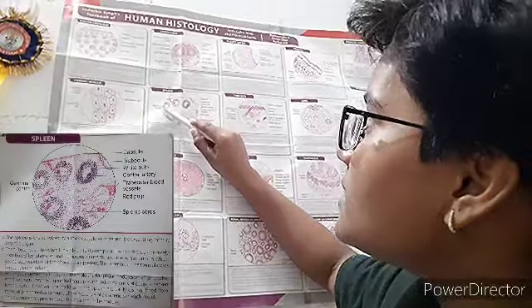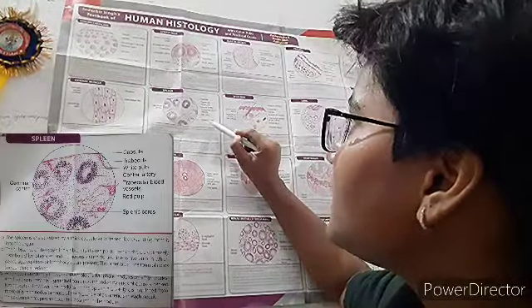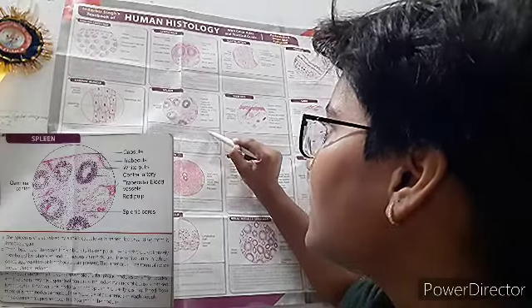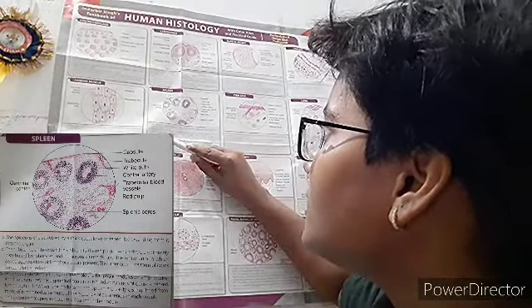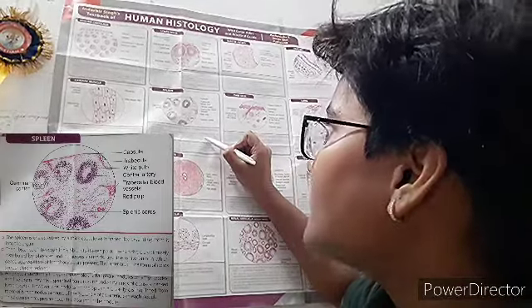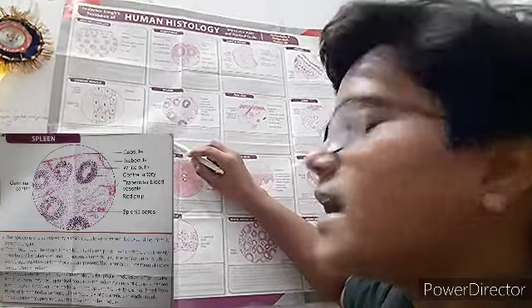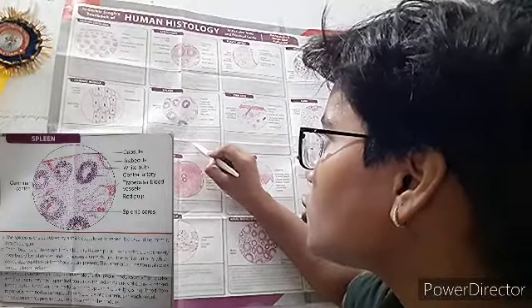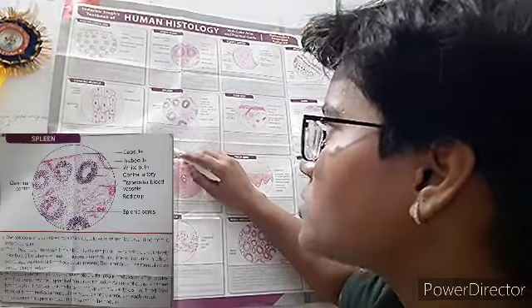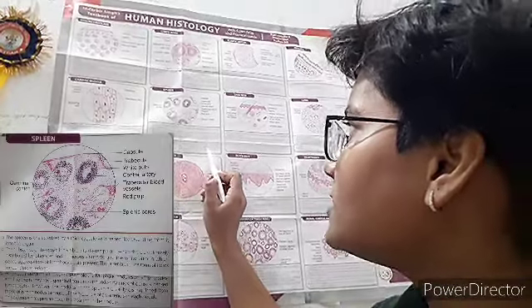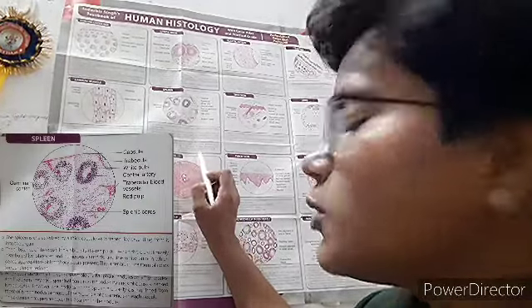Now the spleen. Visible structures include germinal center, capsule, trabeculae, white pulp, central artery, trabeculae blood vessels, red pulp, and splenic cords. The spleen is characterized by a thick capsule with trabeculae extending into the organ. The organ is divided into red pulp — which has diffusely distributed lymphocytes and numerous sinusoids — and white pulp, where dense aggregations of lymphocytes are present in cords surrounding arterioles. When cut transversally, the cords resemble lymphatic nodules with germinal centers. The nodules of the spleen are distinguished from those of lymph nodes by the presence of an arteriole in each nodule, occupying an eccentric position.